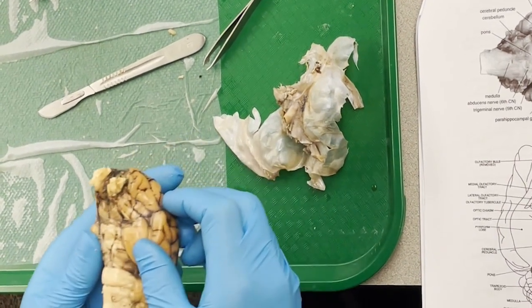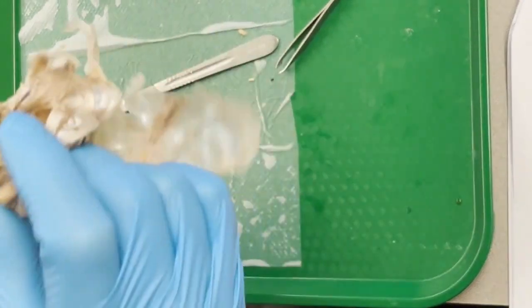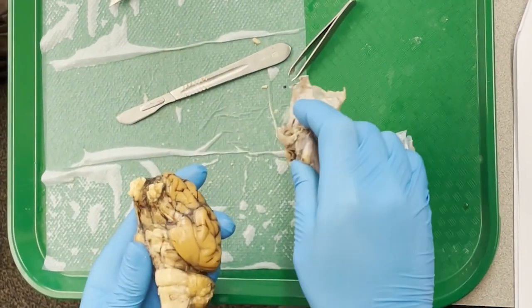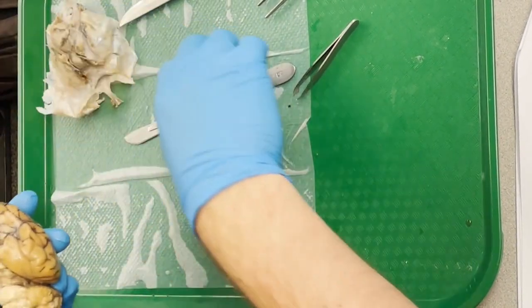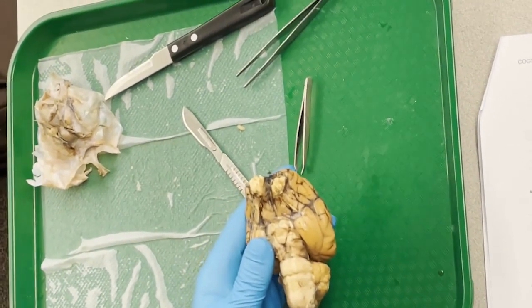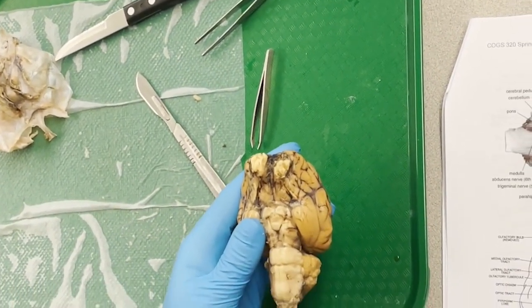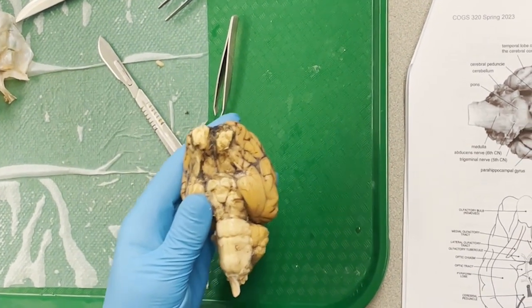We took off the pituitary, which we removed from the dura. As I mentioned, it's this lump that's on the bottom here. And mind you, it's like a hard lump if you try to feel it. The pituitary normally covers up this other area that's sort of in the middle. So if you go behind where it says optic chiasm, or more south from there on the paper, you'll see this little thing that says infundibulum.